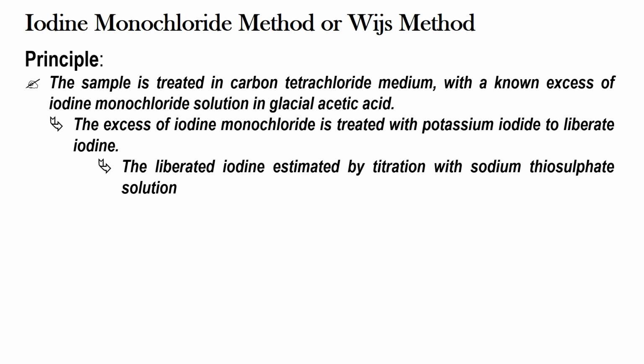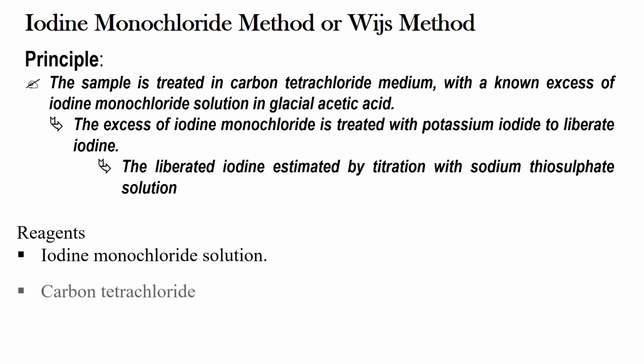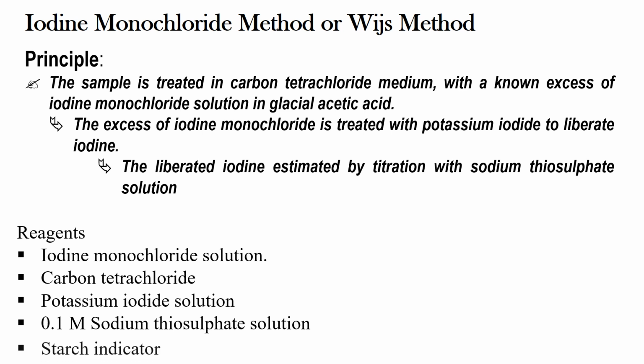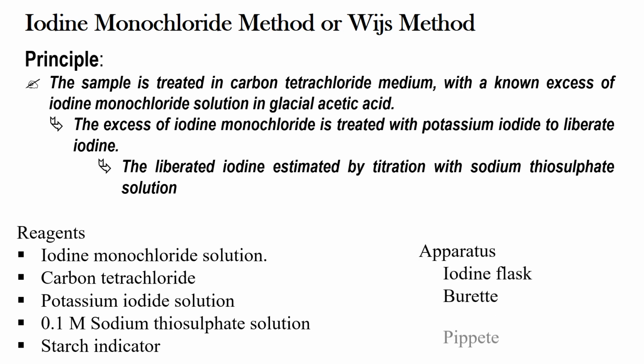The reagents required here are iodine monochloride solution, carbon tetrachloride, potassium iodide solution, 0.1 M sodium thiosulfate solution, and starch indicator. The apparatus here include iodine flask, burette, and pipette. As the name itself indicates, here the iodine monochloride solution is the very important reagent.